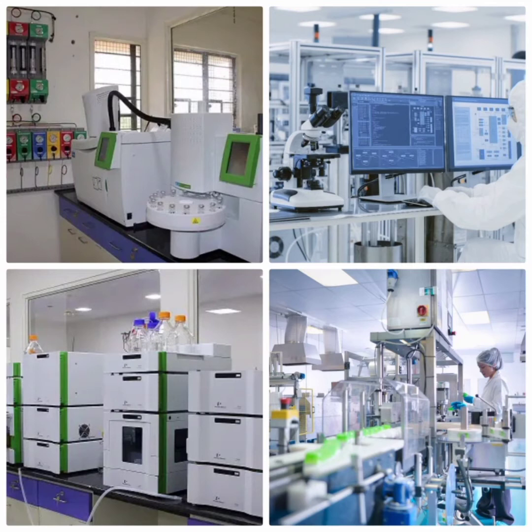On the other hand, gas chromatography detection is based largely on destructive principles such as FID, NPD, and FPD. Mass spectrometry detectors common to both liquid chromatography and gas chromatography are destructive in nature.